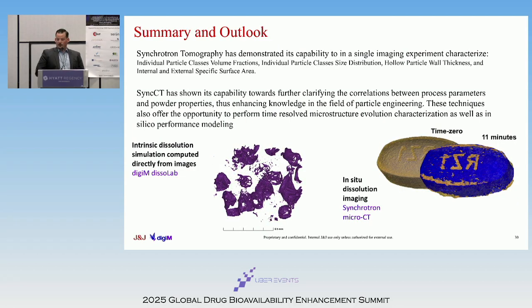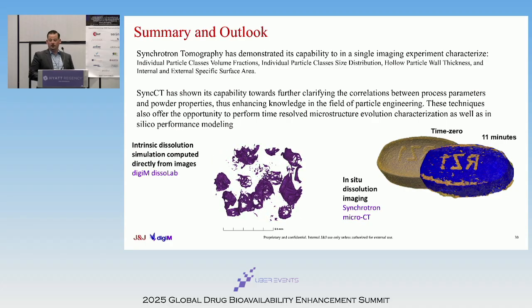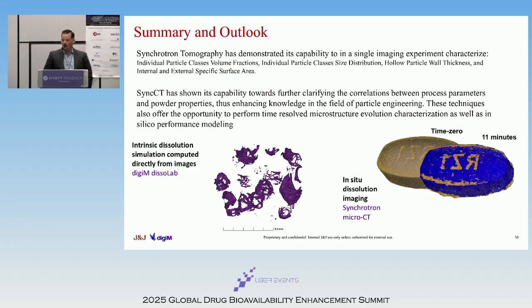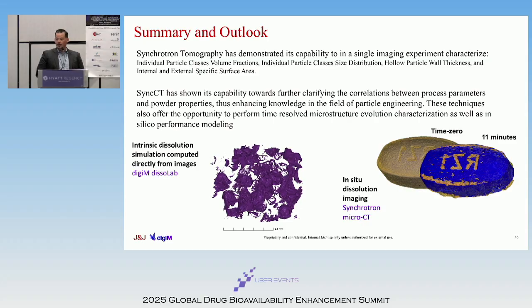And then to wrap up, we demonstrated how Synchrotron CT can be used in a single imaging experiment to give us access to quantify unique things like individual particle class volume fractions, individual class size distributions, hollow particle wall thickness, and internal and external specific surface area.